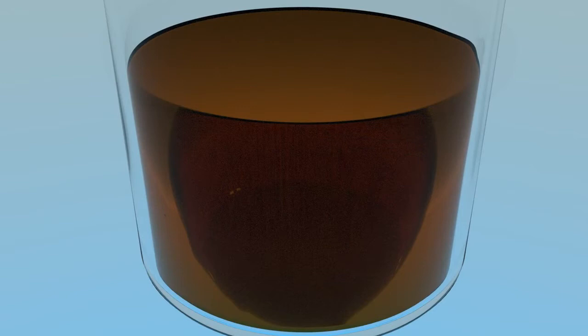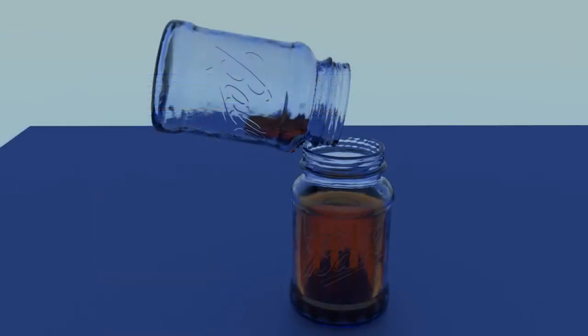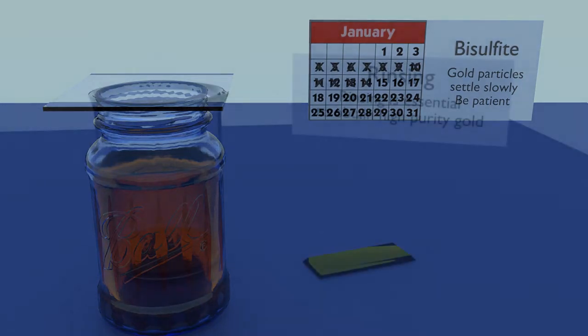If working with sodium metabisulfite, particles of gold will be floating in your waste solution. They are hard to see because the solution is dark and the particles are very tiny. If we make the solution transparent, we can clearly see the particles. Typically when working with bisulfite, these particles represent about three and one half percent of your gold. These particles are very tiny so they will take several days to settle. Just be patient and you can recover this metal. You may have to decant and wait several times before all the metal is recovered, but if you are patient, when working with bisulfite, one hundred percent recovery is quite typical.